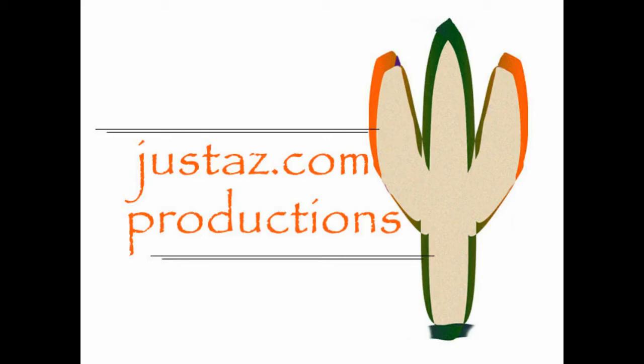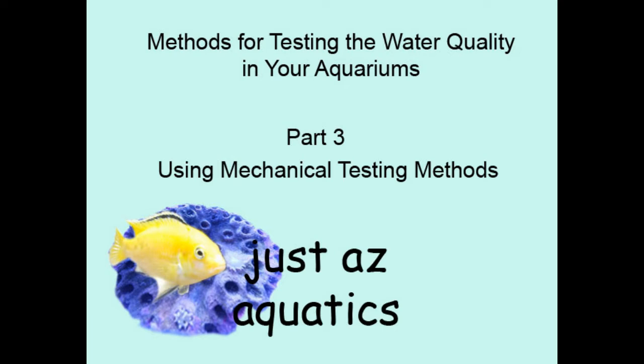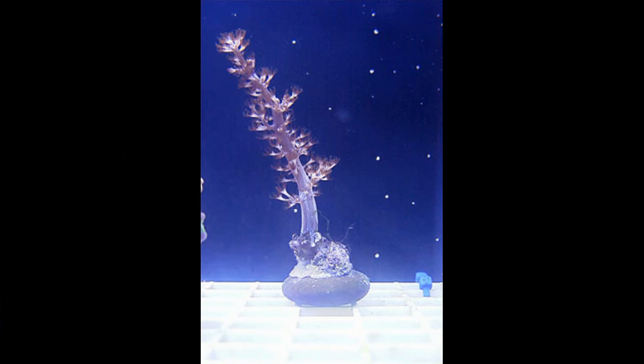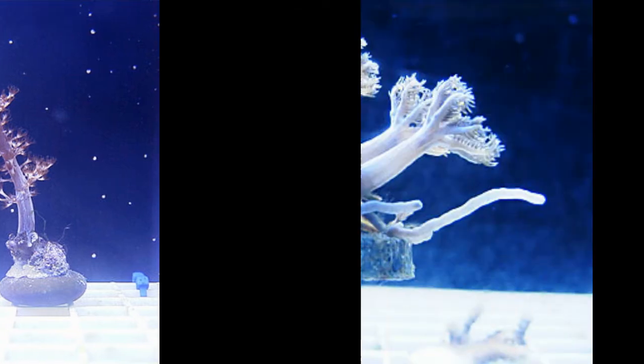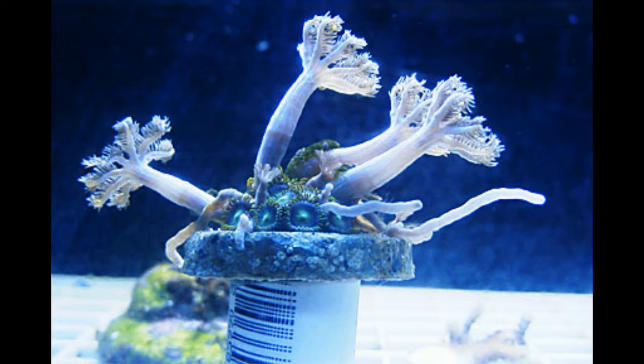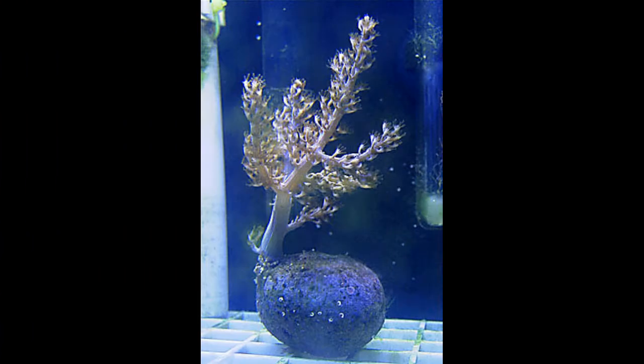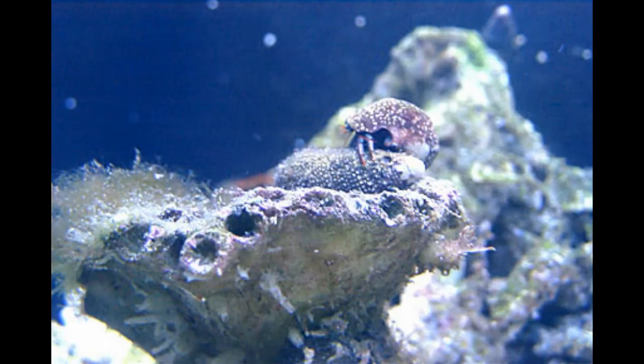Justaz.com Productions with Justaz Aquatics. Methods for testing the water quality in your aquariums, part three: using mechanical testing methods. Salt water aquariums — in this case a coral tank — require a specific range of salinity, or a certain amount of salt in the water for the livestock to thrive. However, what we're really measuring is the specific gravity, which is the density of the salt water in relation to the density of the same amount of pure water.